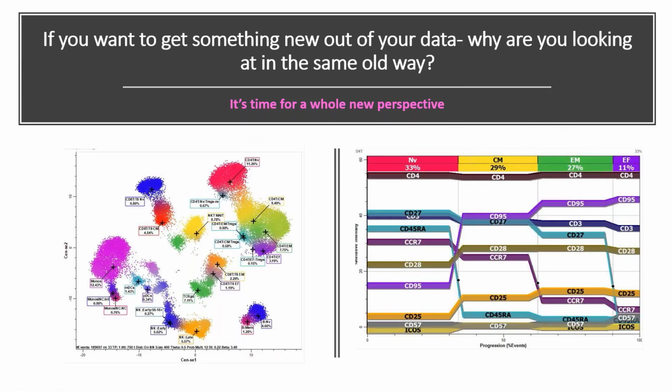So we understand that there are so many different analysis programs and algorithms to choose from, and there's also a great deal of confusion about the best choice for analyzing high-dimensional data. So we would like to offer you a solution that can not only analyze your data, but give you a whole different way of looking at it. GemStone has a revised user interface and added features that provides you with a comprehensive package that will help you get the most out of your data.